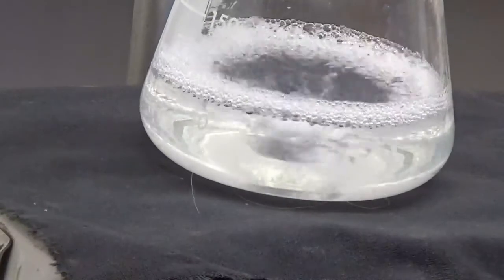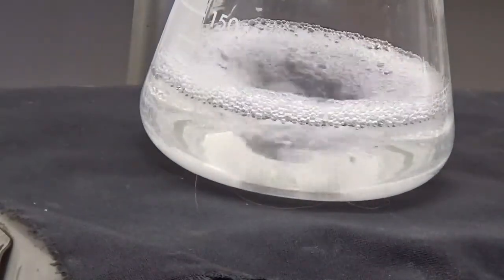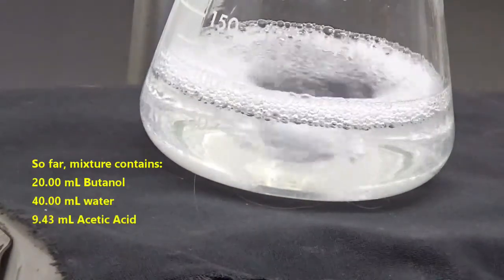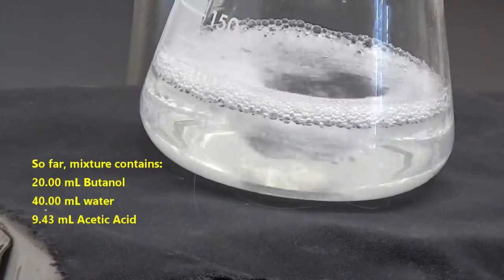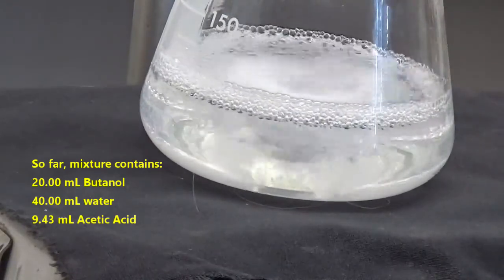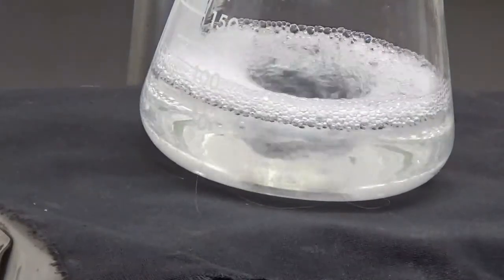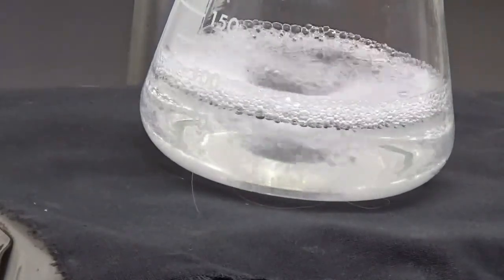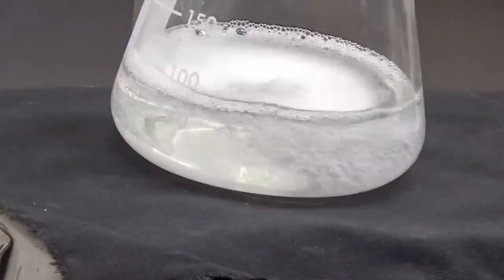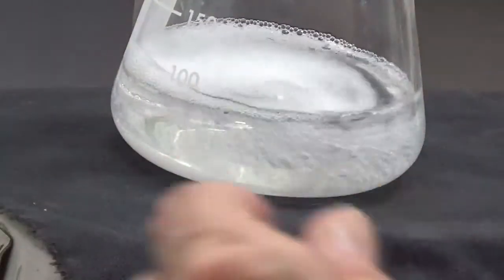Okay, so that's definitely clear. Let's see, that's 9.43. Right now I add another 10. Look at that bubbling. That seems to happen near this turbid point. I don't know. All right, another 10 mils of water.